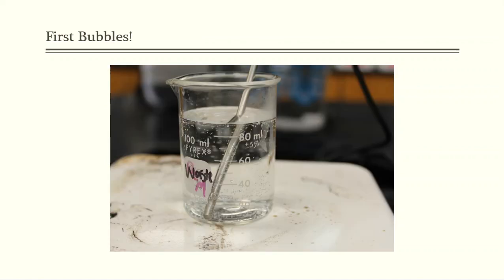All right, so as I continue to heat this up, you know, this is just heating water, folks. That's all that this is. So if you heat spaghetti water at home, I mean, there's no observational changes here that are surprising. You're starting to see a little bit of bubbles that show up in my beaker as it's getting hotter and hotter, not quite 95, but it is hot.